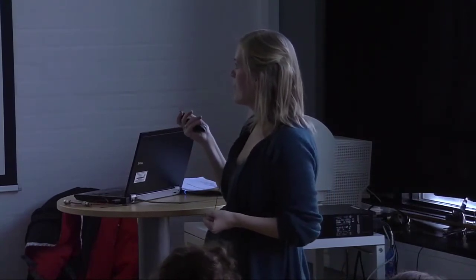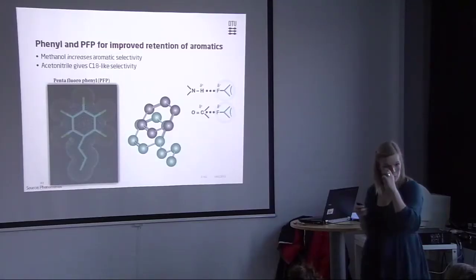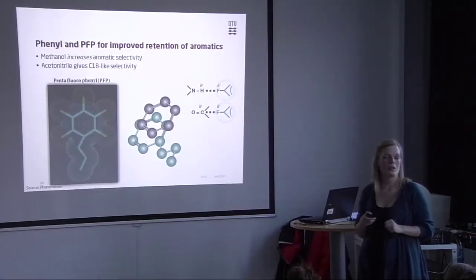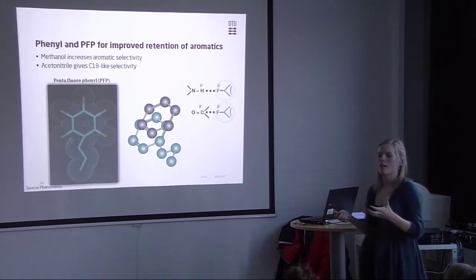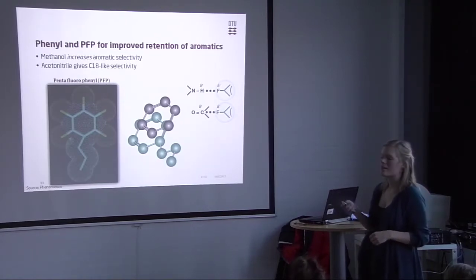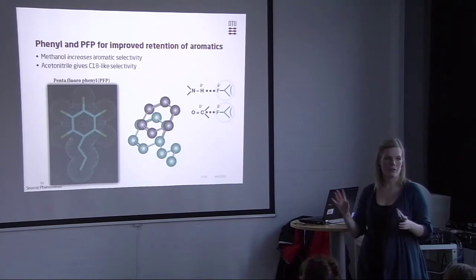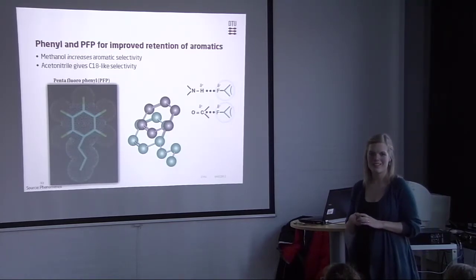And also you have that dipole interaction in your pentafluorophenyl group, which also gives you a different selectivity. So if you got aromatic compounds with similar polarity to a non-aromatic, you can actually change that selectivity by choosing a different type of reverse phase column. Questions?